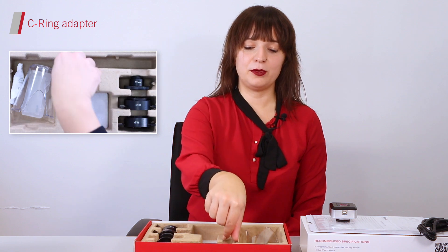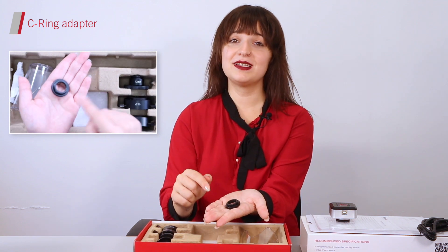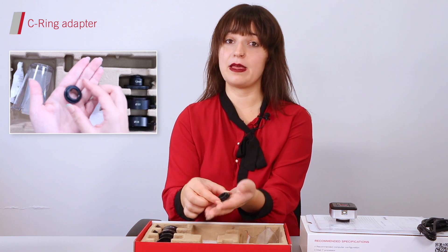Then, to the left of your cable, you will find your C-ring, which will be useful if you need to adapt your camera to any adapter that might not have it included.